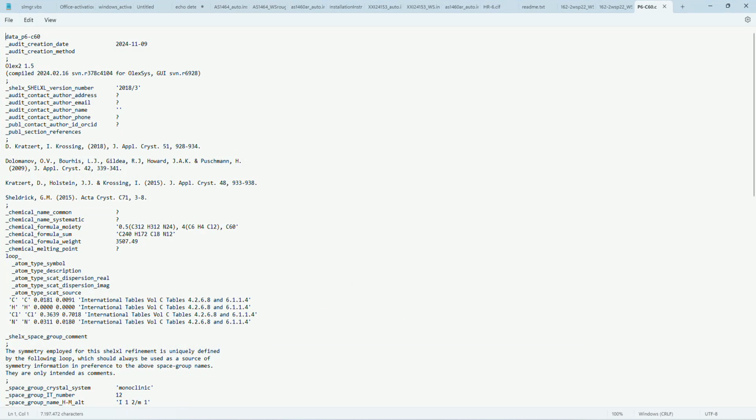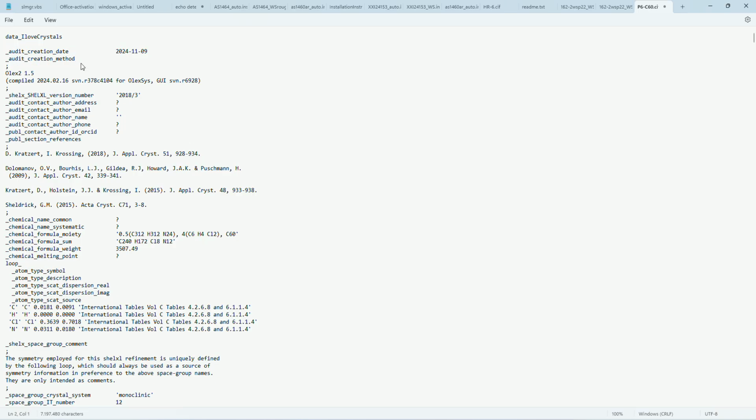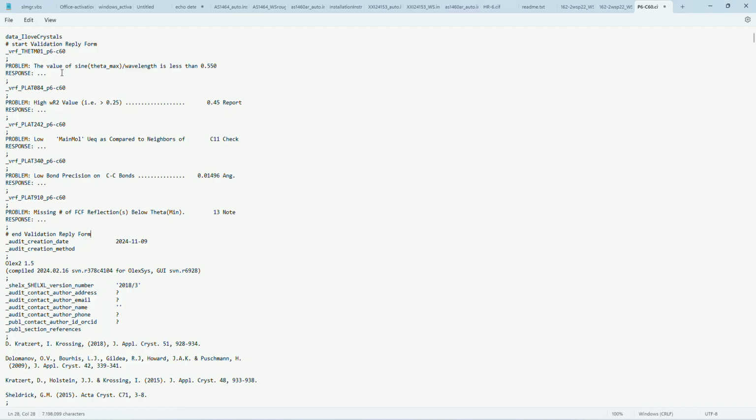Here we can change the name that will appear on our CheckCIF report. So for example, I don't know, I love crystals. It sounds like some drug addict said that, but well, let's just leave it like that. Okay, and then we can basically copy and paste that below. So we can put it here and then explain everything, right?